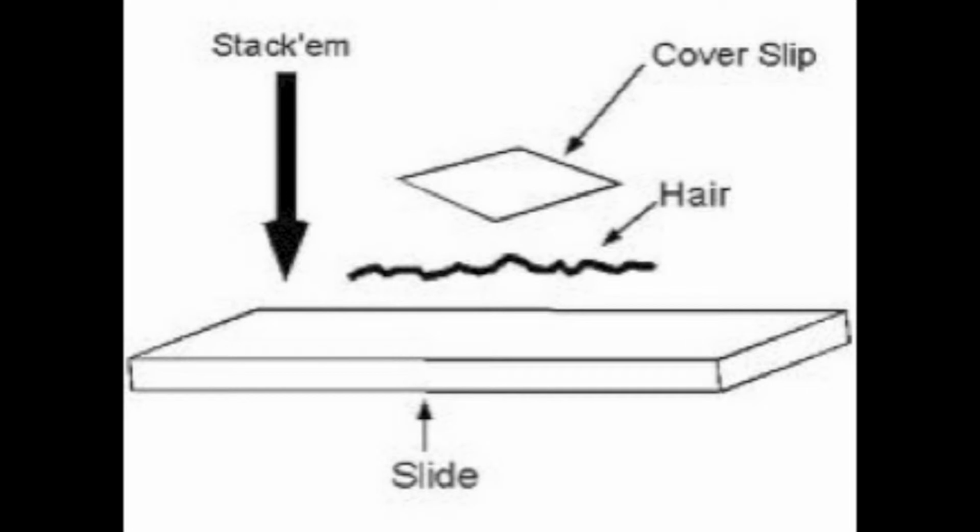The dry mount does not require any mounting media. You simply place the hair sample with the cover slip on a glass slide.